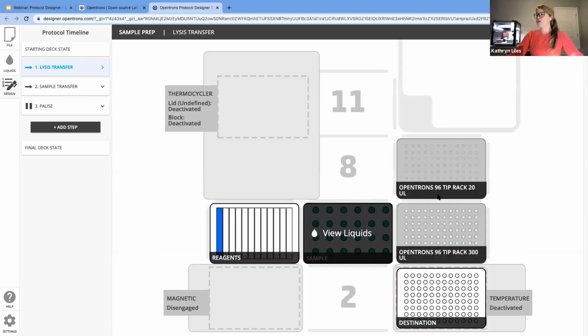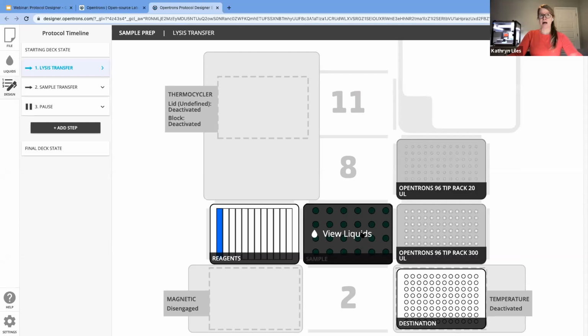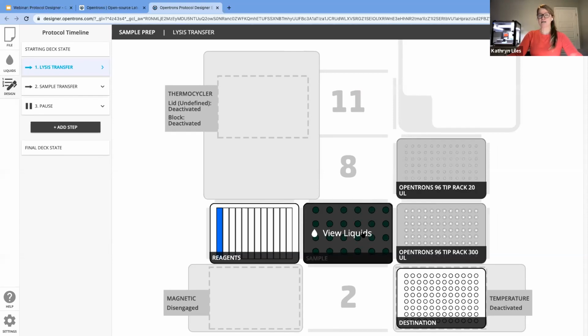That's a great question. When you build your work table on the OT2, you will be using labware that matches the exact labware definition in the software, so that the geometry in the software is exactly the same shape and form as what you're actually using. Each of these labware definitions in our library contains that geometry information.